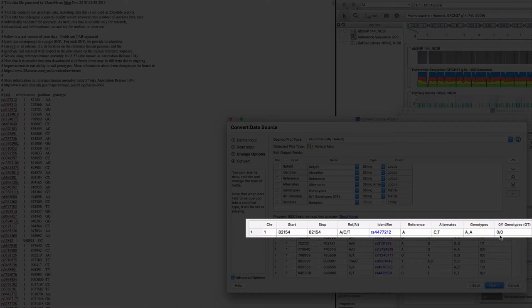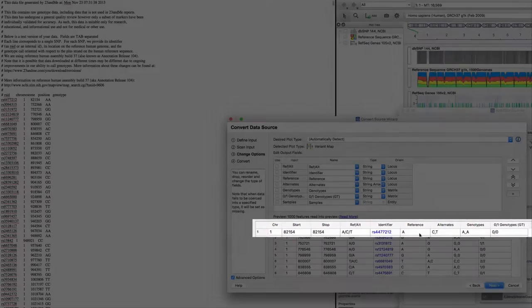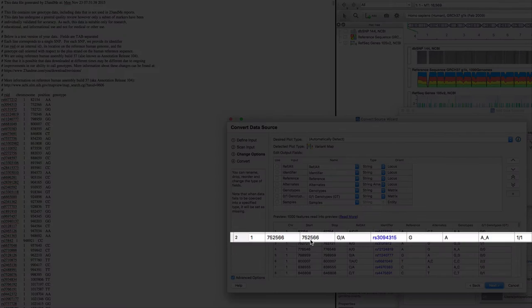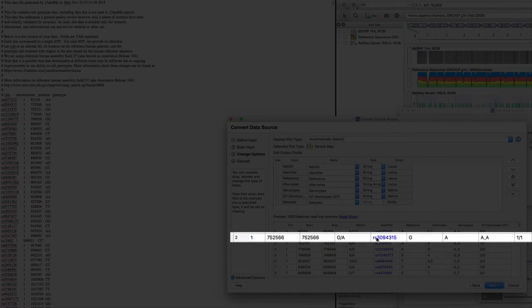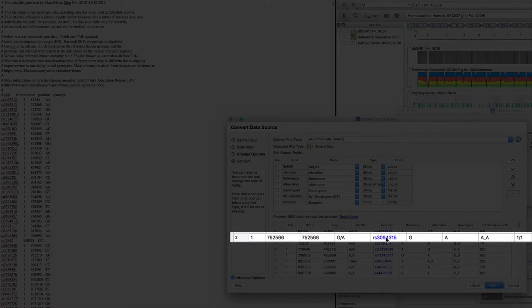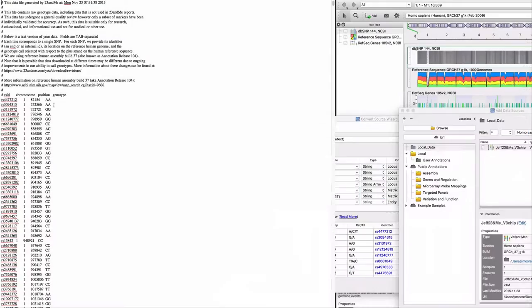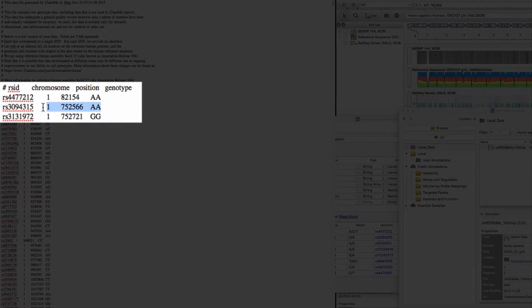Notice that the conversion wizard added some additional fields. The second line is SNP RS3094315 at position 752566 with genotype AA. The second line of the raw data file is a perfect match.